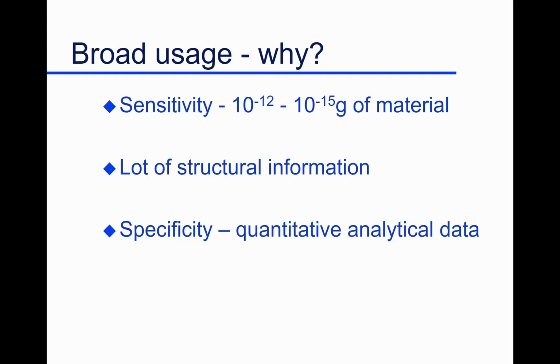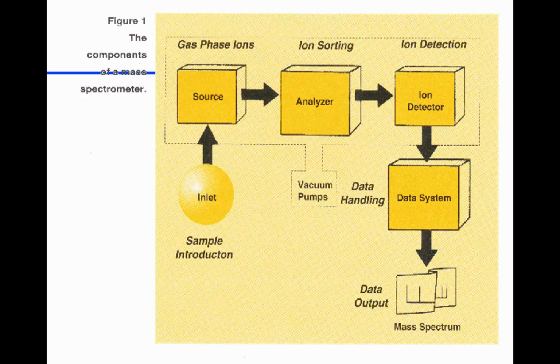And of course, when we're in the laboratory, we want to measure and quantify things off a liquid chromatograph, off a gas chromatograph, any kind of separation device. It's really good in terms of specificity. We can key in on what we want to measure and exclude everything else. So it really helps us. We don't have to clean up the sample so well. We don't necessarily even have to get separation or resolution. So a tremendously powerful tool.